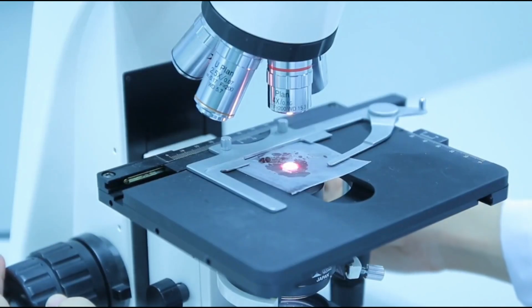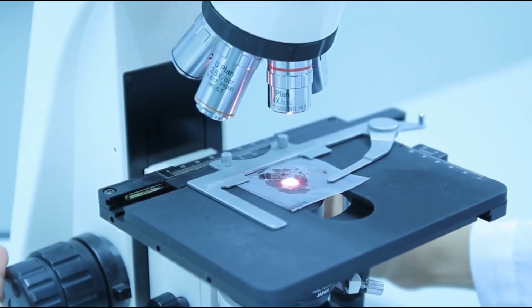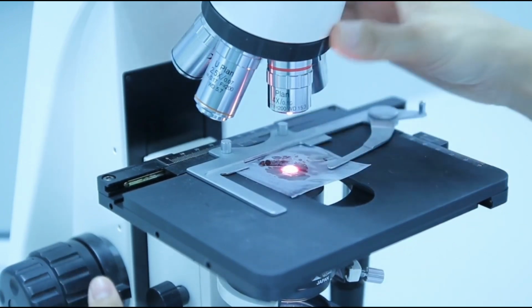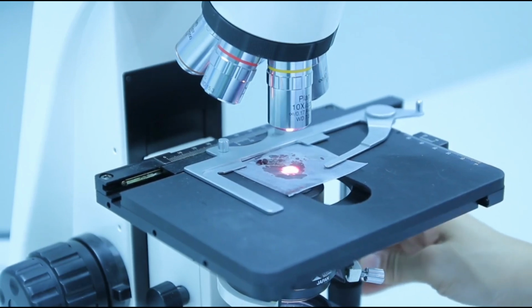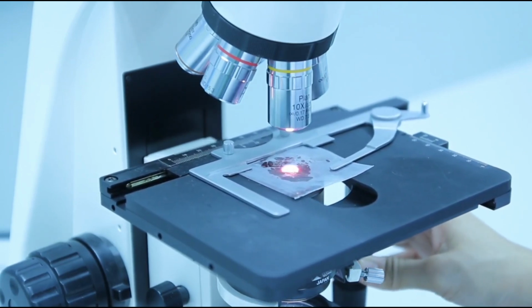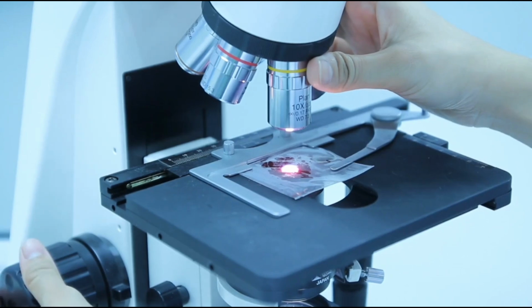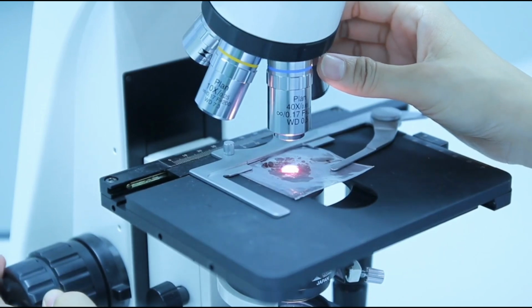A microscope is an intricate instrument that allows us to peer into the unseen world, revealing the intricate details of tiny structures that are otherwise invisible to the naked eye. This powerful device transforms our understanding of biology, chemistry, and material science, opening up avenues of exploration that once seemed almost magical. At its core, a microscope typically uses a combination of lenses to magnify objects.